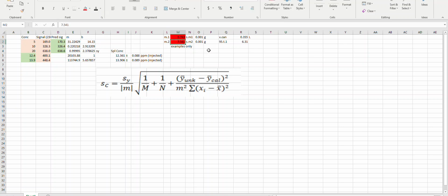Use your data. Okay. So let us figure out how many parts per million we have in the Coke.